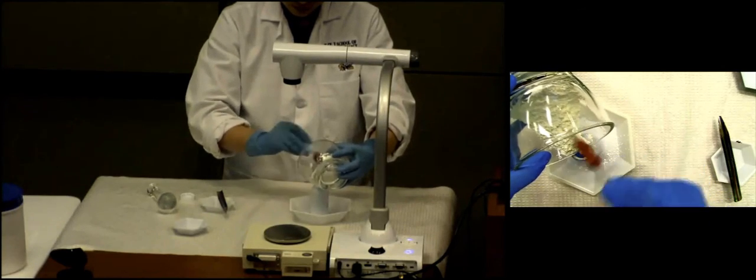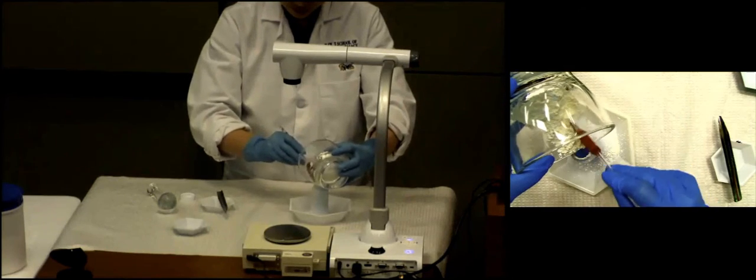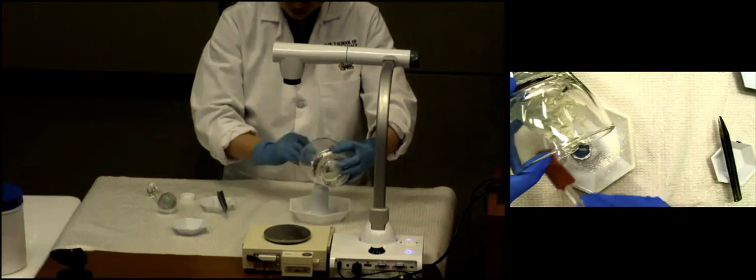Good as Judy is, you see powder going everywhere a little bit. That's why the weigh boat's there regardless, even if you do it carefully. Clearly, this is where loss would come in if you're not careful. So we want you to take your time a little more. Yeah?